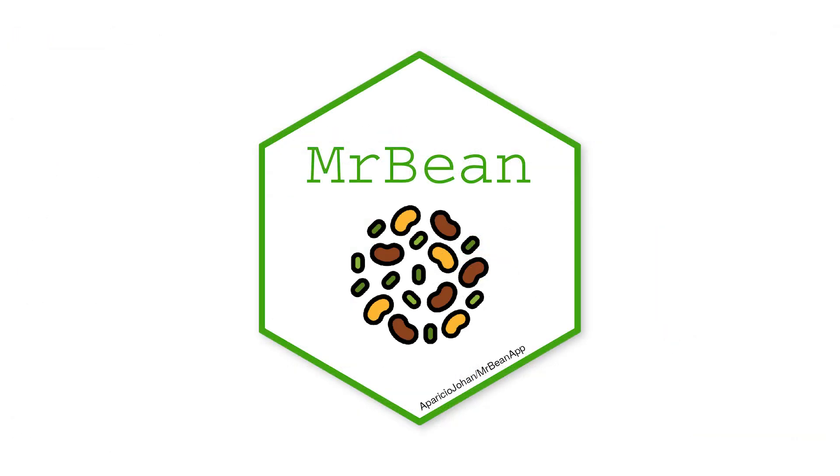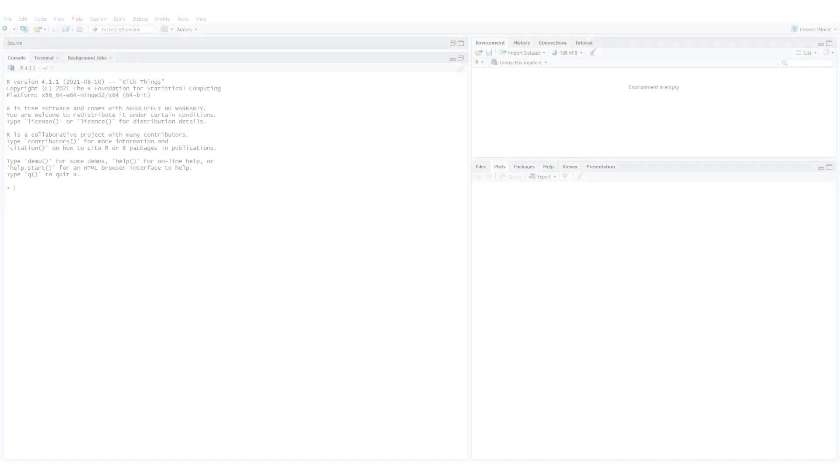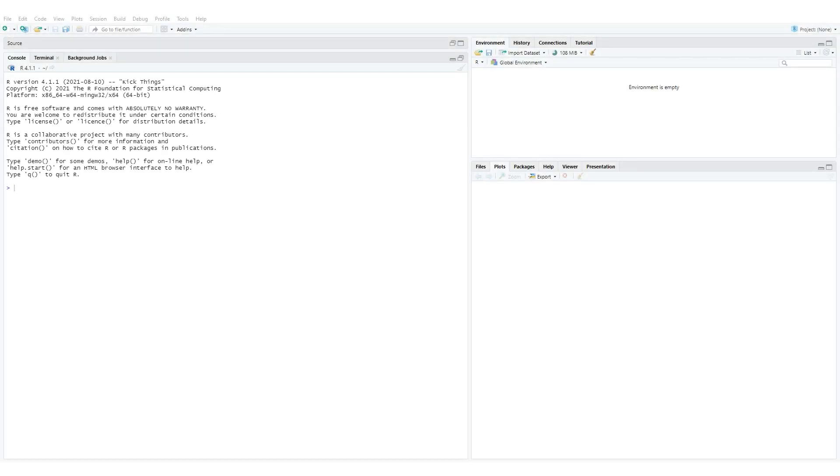In this video, I'll cover how to install and run MrBean with the R terminal, as well as a way to run the application without installing R or RStudio, using Docker. To begin, I'll show you how to install MrBean with RStudio.